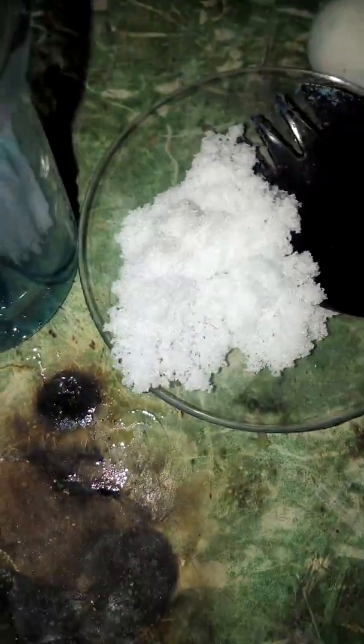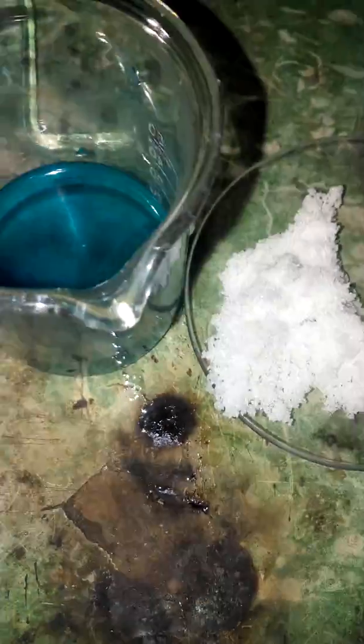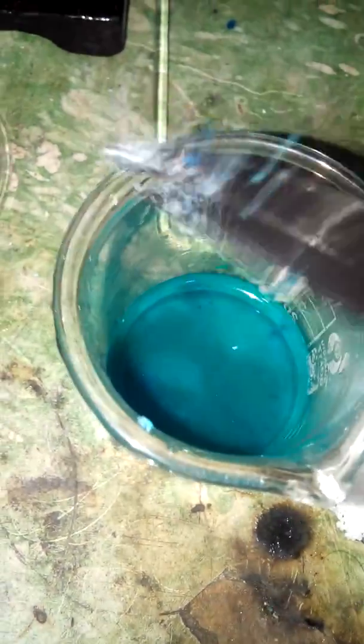Now I'm done dissolving — there is still some undissolved copper sulfate but it doesn't matter too much. Now you're gonna take some table salt and scoop some in and drop it into the solution. Copper sulfate is copper dissolved in sulfuric acid, and it contains sulfate ions.